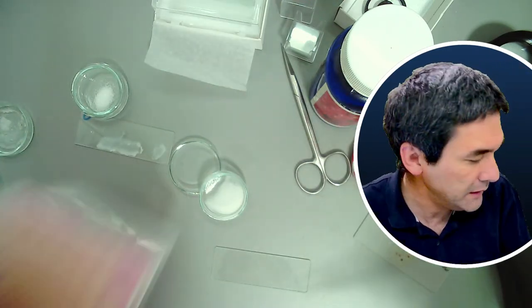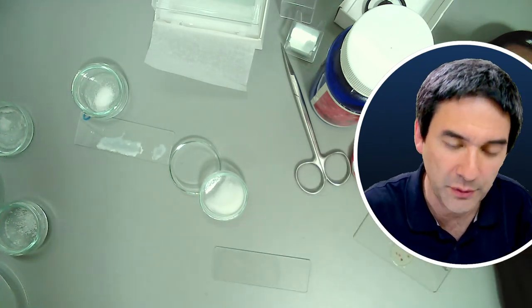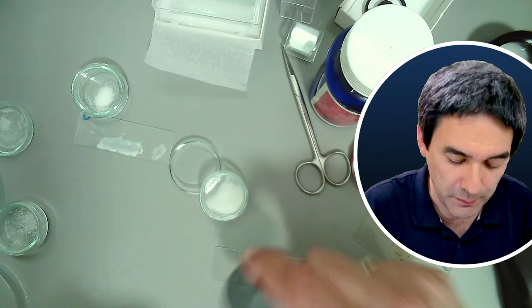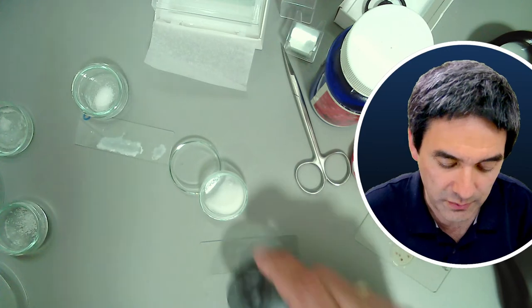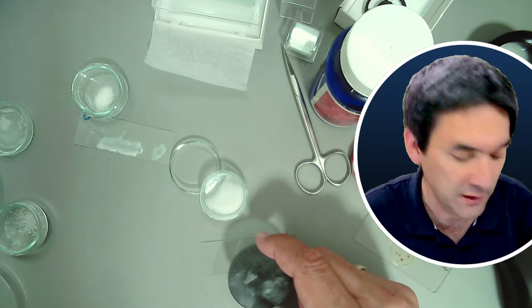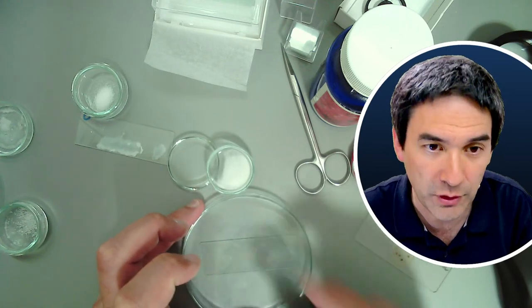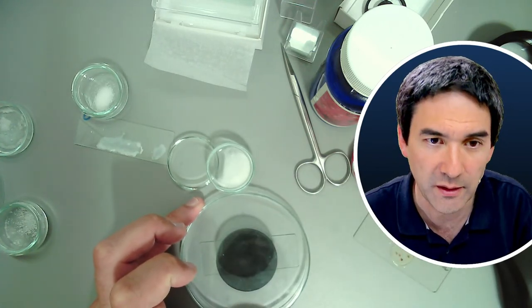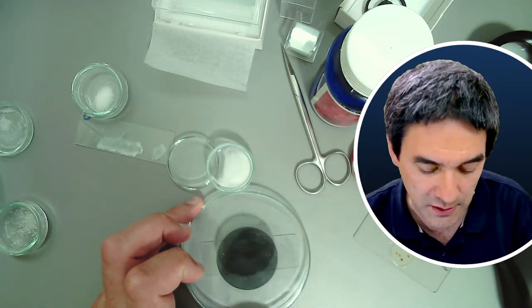Okay, and what I have to do now is the following. How am I going to put the analyzer on top? Because if I put it on top, it's going to touch the solution. I don't want that. So what I'm going to do is put a petri dish over it, so that I have a spacer like this. That's the strategy that I'll be using.